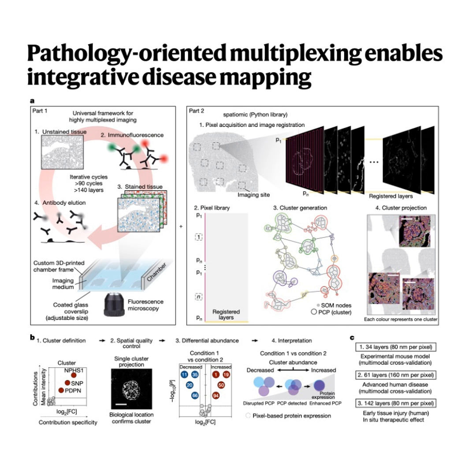And for the liquid handling, doing all those washes and antibody additions for 40 samples over 95 cycles, automatically, they came up with a low-cost automation solution. They essentially repurposed a standard 3D printer to act as a precise liquid handling robot. A 3D printer? Seriously? It cut down the hands-on lab time by about 70%. It's this cool combination of high-tech biology and, well, almost garage-level engineering ingenuity. That's brilliant. Okay, so the hardware side is sorted, robust, and relatively accessible.